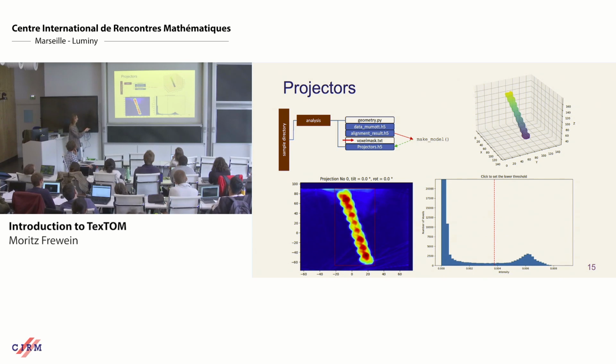So yeah, in this case here we see all these voxels that are here. So we have intensity and the number of voxels is probably the air scattering around. And here this part is actually our sample. So when it comes down more or less here, you can choose your threshold.